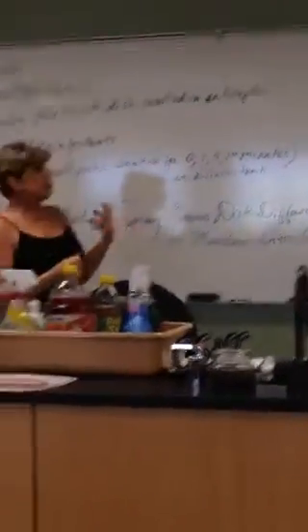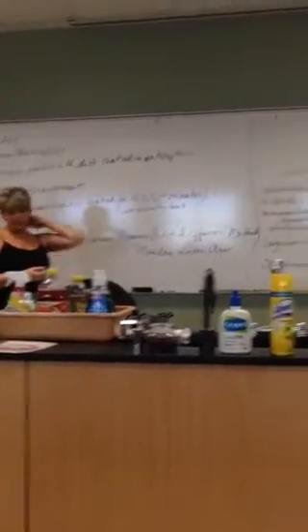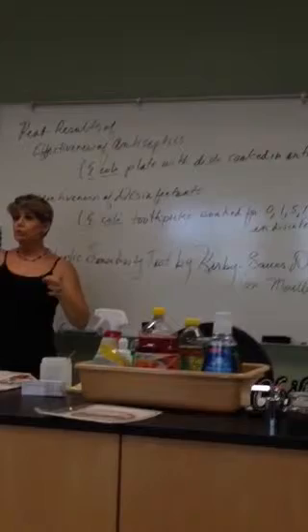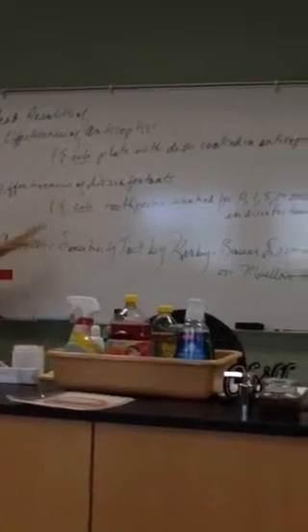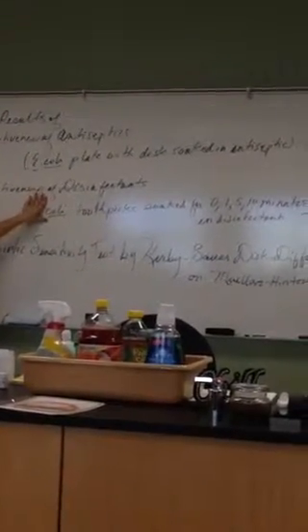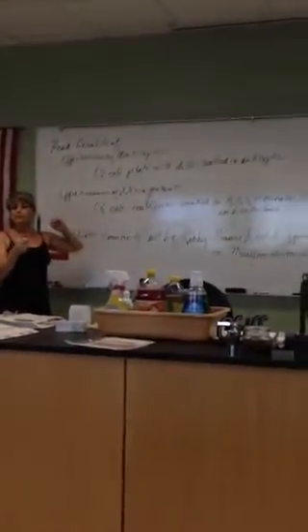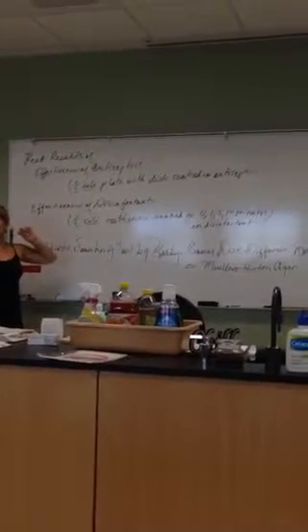So after you measure your zones of inhibition and decide if the bacteria are sensitive or resistant to the particular antibiotics, we'll put them up on the chart on the board and we'll discuss them. And then you also have your disinfectant plates, your disinfectant test tubes, to look at where you had the toothpick soaked in E. coli. Those you can save. We'll check them again next week. Sometimes the effect of the disinfectant doesn't really show up until like a week later.